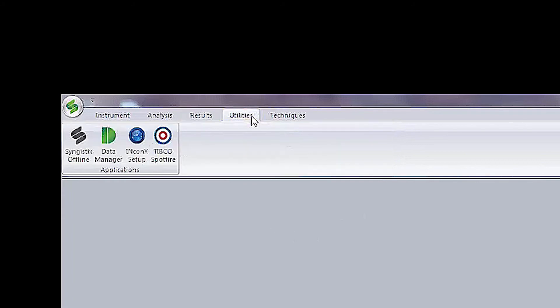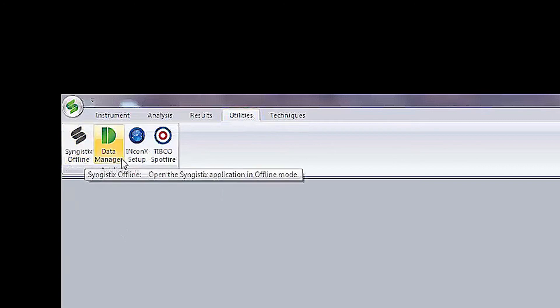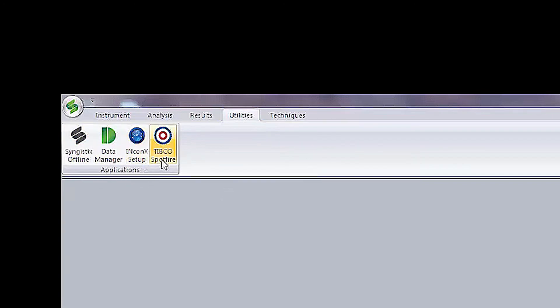The fourth is the Utilities tab. Here you can access all additional applications that interface with Syngistics.